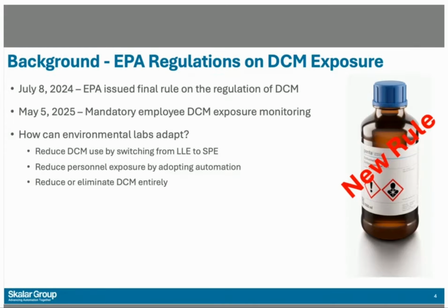So one way to reduce DCM use could be switching from LLE, liquid-liquid, to SPE. By then taking that SPE process and automating it, then you're removing, or reducing, the personal exposure. There's less time of a person actually handling the substance.